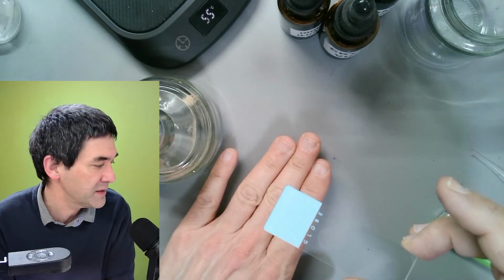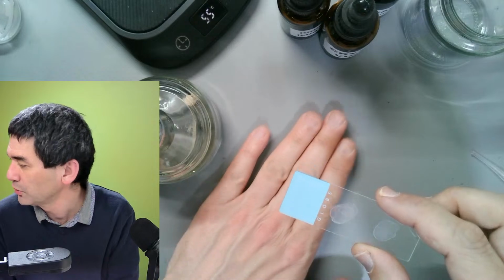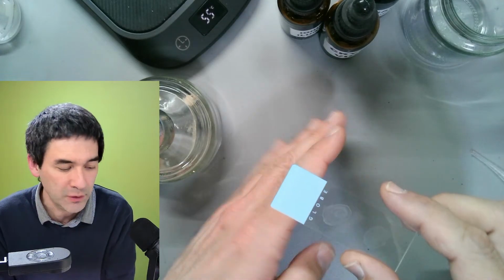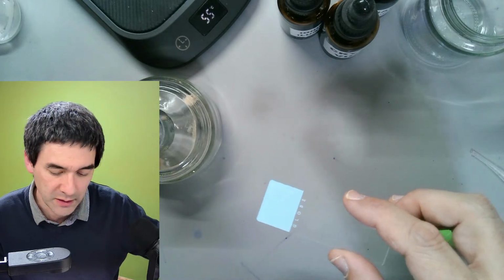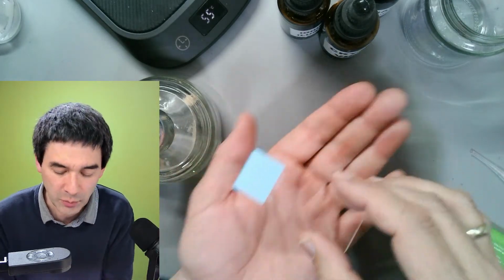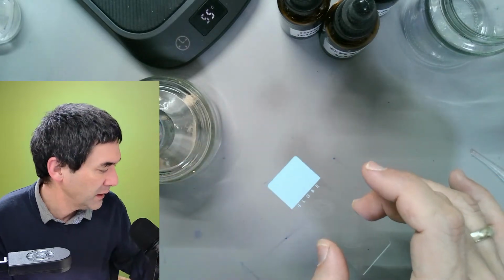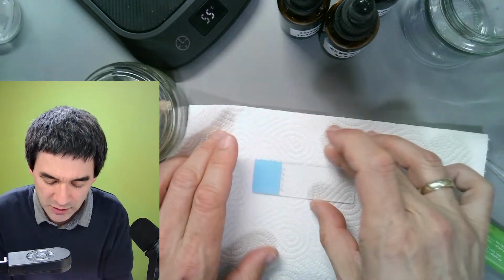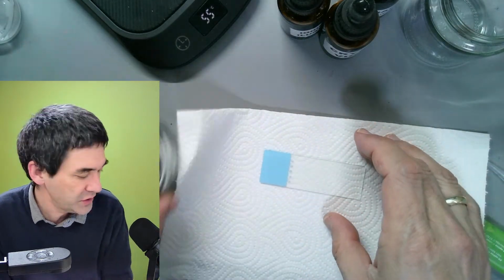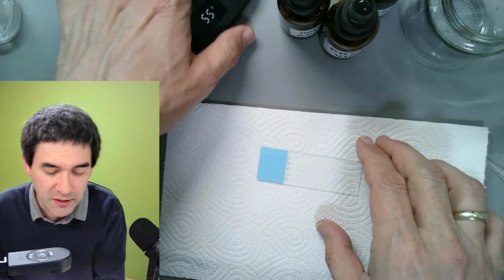If I put it on the plastic surface over here, then it's going to melt. So usually, you can put it on a glass Petri dish maybe. Or maybe I'm just going to keep it here, and I'm going to wait until it cools. It's still quite hot. And what I'm going to do is I'm going to do all of the staining on this tissue paper here, because otherwise, I might get some of the stain on the surface.